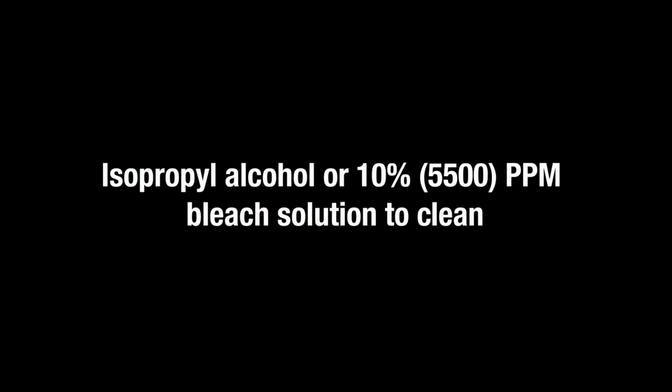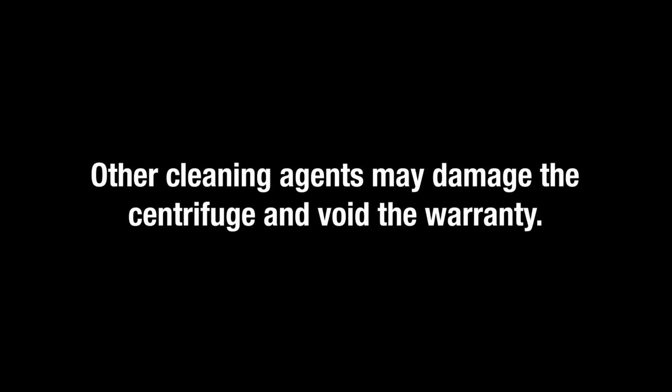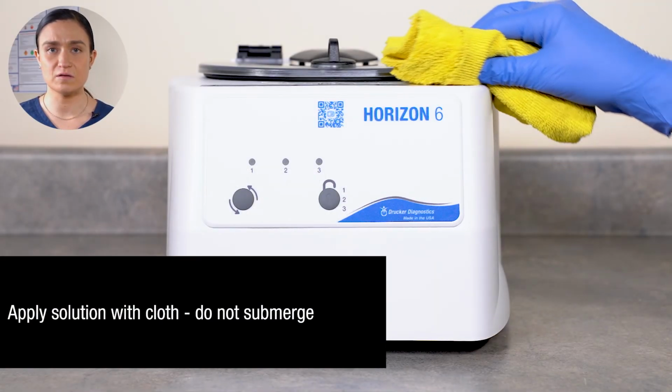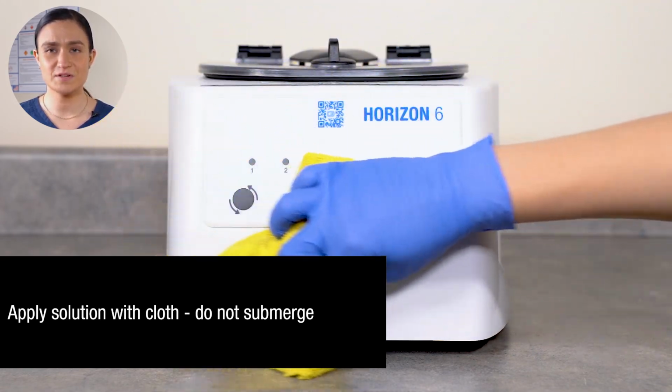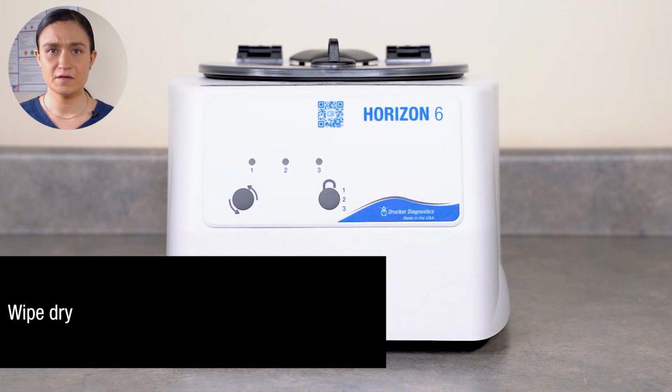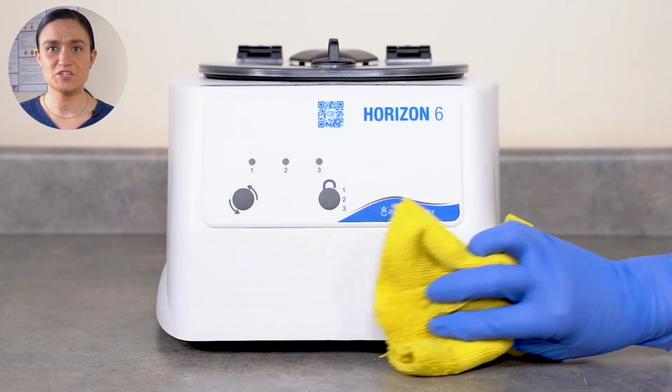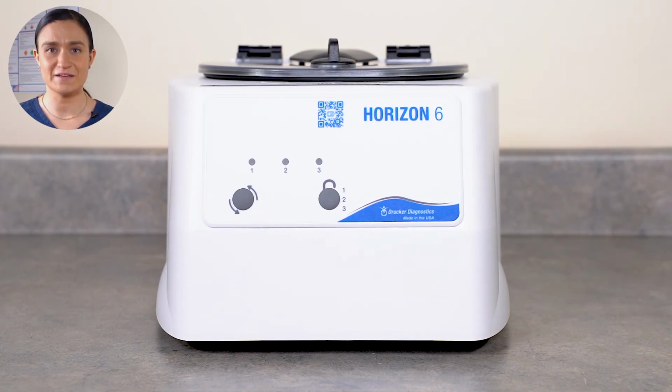Use isopropyl alcohol or 10% 5500 ppm bleach solution to clean. Only the approved isopropyl alcohol or 10% bleach solution should be used. Any other substance is not approved and may cause damage to your centrifuge and void the warranty. Apply your isopropyl alcohol or 10% bleach solution with a cloth. Do not submerge the centrifuge in water. Dry your Horizon 6 immediately after finishing cleaning and disinfecting, and be sure it's plugged in and turned on so it's ready for the next use.